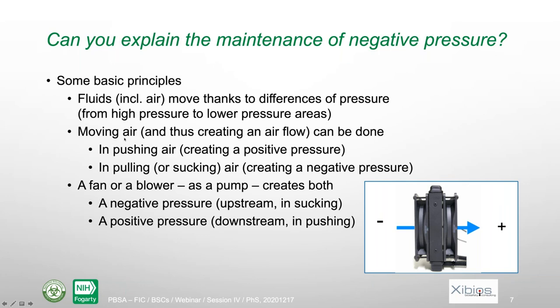And then we can move the air on purpose and thus create an airflow ourselves. And that can be done by pushing the air, creating a positive pressure, the air which is pushed in positive pressure, or by pulling or sucking the air.